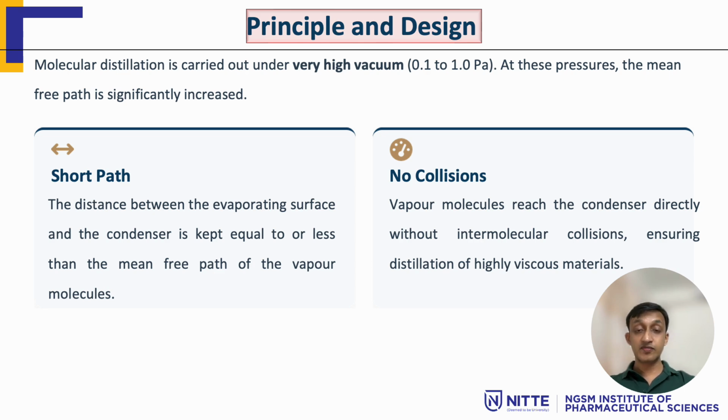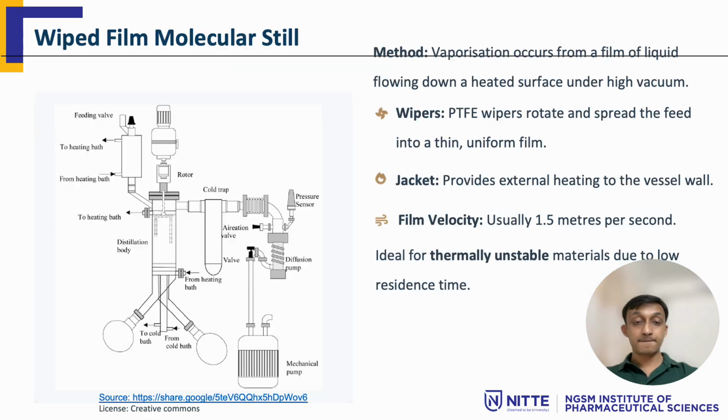Building upon the concept of mean free path, let us now understand the operational principle and design of the molecular distillation system. One of the most widely used configurations of molecular distillation is the wiped film molecular still.